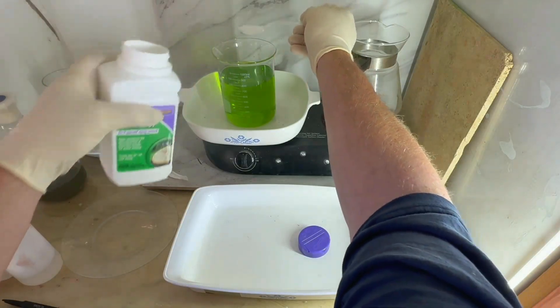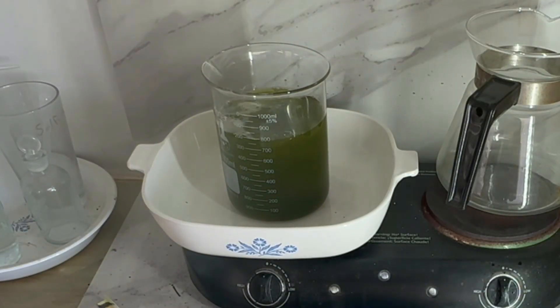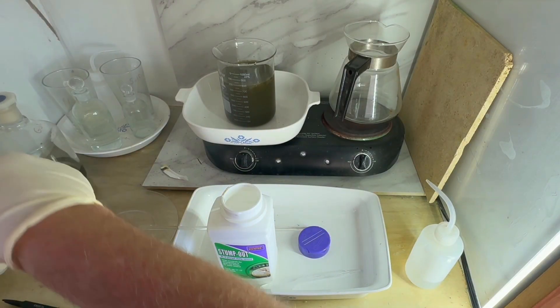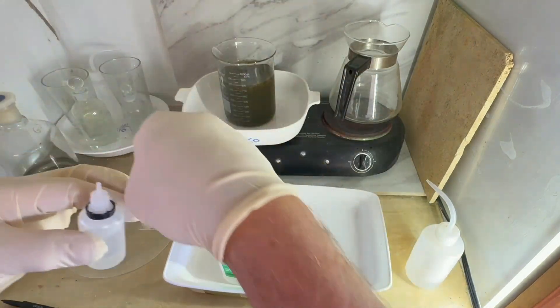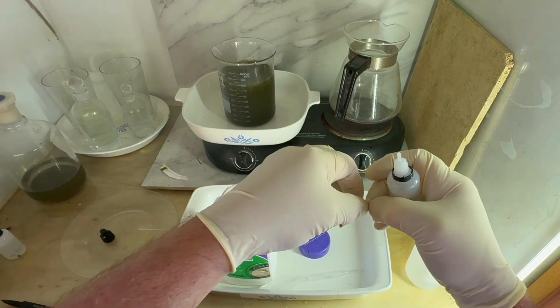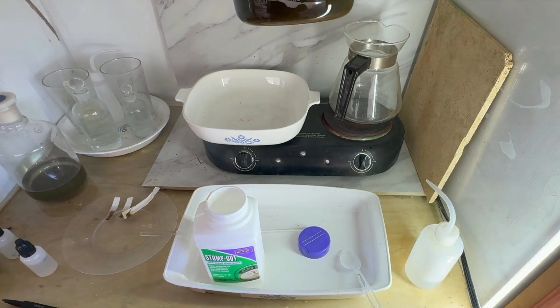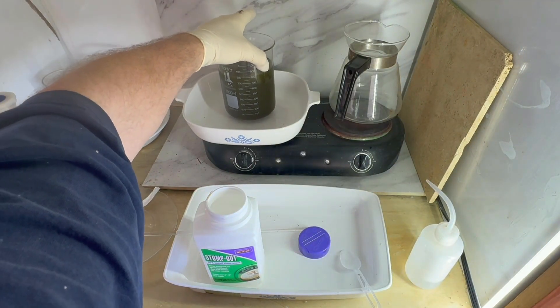I'm going to use SMB to precipitate the gold out of solution. I'll do a stannous chloride test to make sure all the gold is precipitated. The test shows some color but it's brown rather than the purple we'd expect for gold — that means I probably put too much SMB in, but it's not an issue as it rinses out easily during the wash. We can see the powder starting to settle on the bottom, so we'll cover it and let it settle.